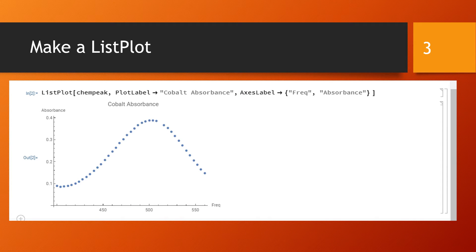Next we make a list plot of the data named ChemPeak and we give it a plot label of cobalt absorbance, and we give it axis labels that's an x-y pair: the x is frequency and the y is absorbance.